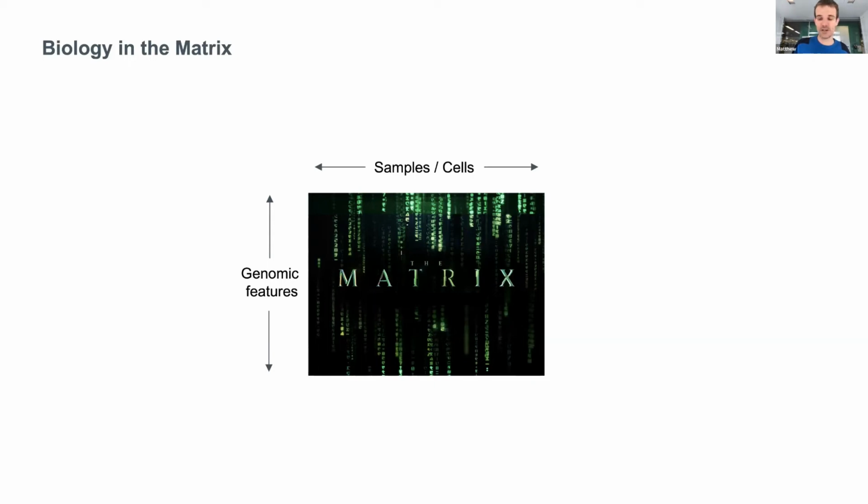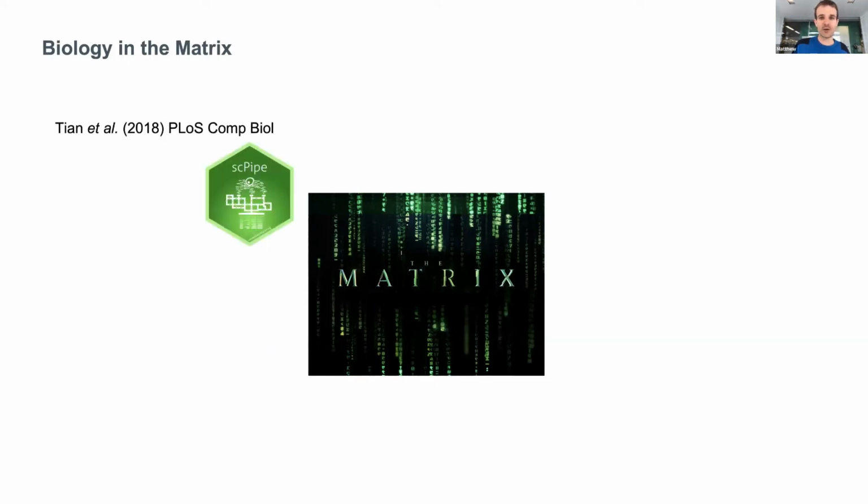So we develop analysis tools, and one that we started with, our first foray into single cell analysis, was how do you actually build that data matrix from the raw sequences that you're getting off the sequencer. So handling the barcodes and the UMIs to keep track of it and do all the bookkeeping you need to do to get single cell information.